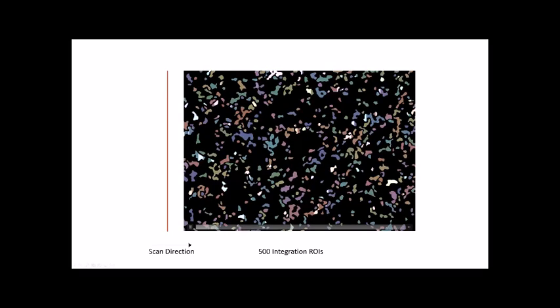The sequence of DMD patterns that you use to do that kind of imaging looks like this. It's sort of odd, sort of kaleidoscopic, but if I pause it at any given point in time, the white pixels are the ones that are open. You'll notice that all the pixels in a given column that belong to a single region of interest are open, but no two regions of interest are open at the same time.